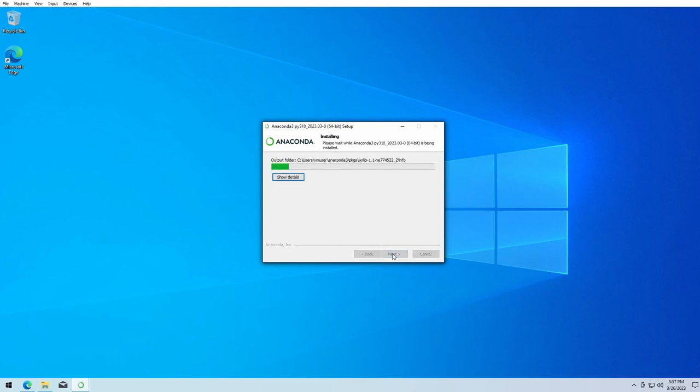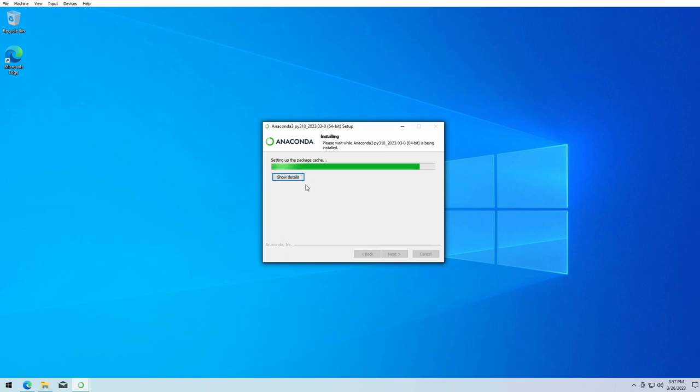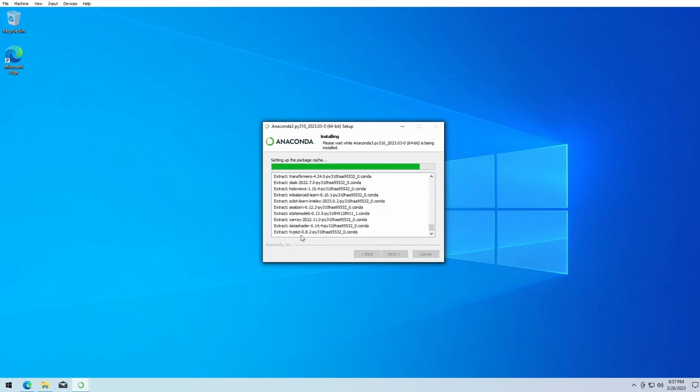This installation, depending on your PC, can easily take five minutes. You can also click on show details to see all the packages and libraries which are installed by Anaconda.